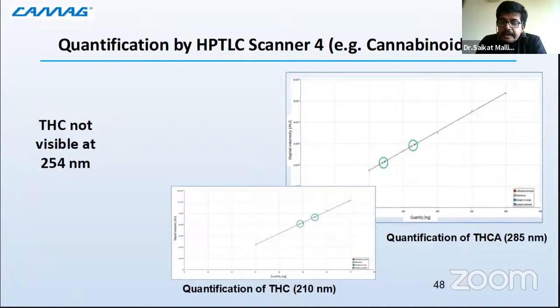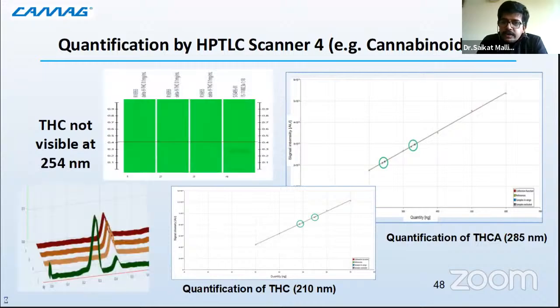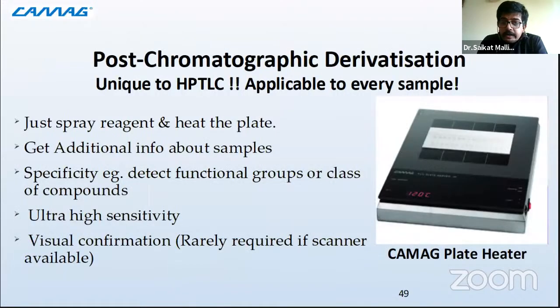So that is another application. You can go very low. You can see over here, in this example, it is at 210 nanometers, which is very low compared to any other format.